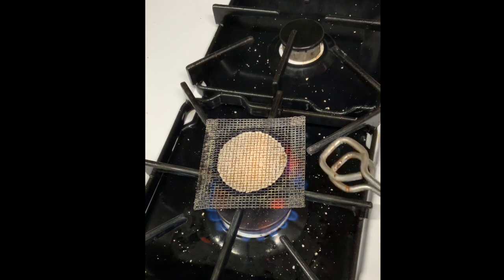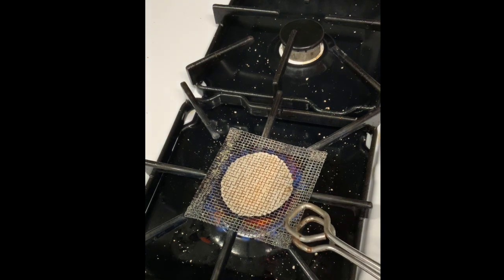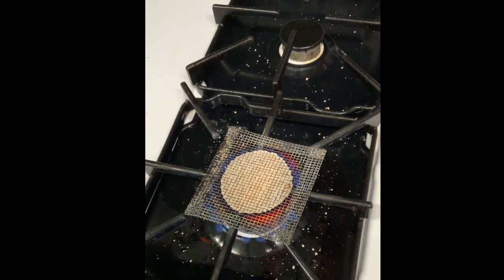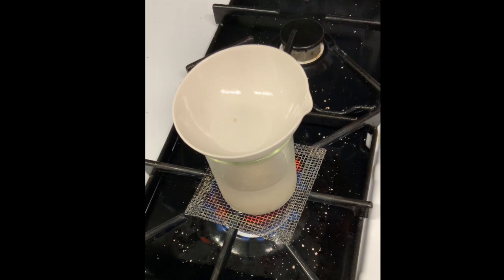You want to be careful about heating the wire mesh. It's going to initially just spark until it's conditioned. And then we're going to put the evaporating dish and the beaker on top, like that. And we want to adjust the flame so there's a gentle boil.